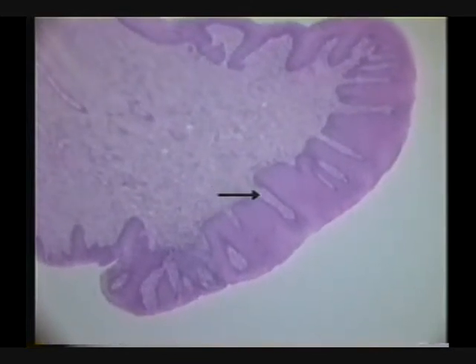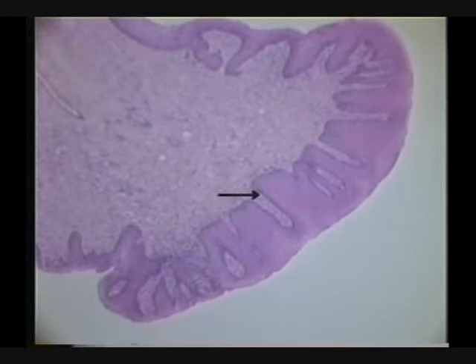So what happens if I go up into here? What is this structure? Well, I don't think we've looked at that. It's a secondary papilla. So we have these things called secondary papillae that reach up inside the epithelium of the papilla. Dumb question just popped into my mind. What's the purpose of a secondary papilla? Ah yes, surface area. It's always the same answer, isn't it? So what do we need surface area here for? To feed the epithelium. Okay, to feed the epithelium. There's going to be capillaries in there and such that are going to feed. This is a pretty thick layer of epithelium, and so you have to have some ways to get some diffusion of nutrients, oxygen, whatever, into that epithelial tissue.